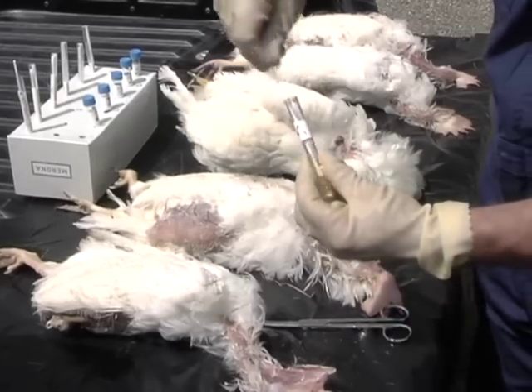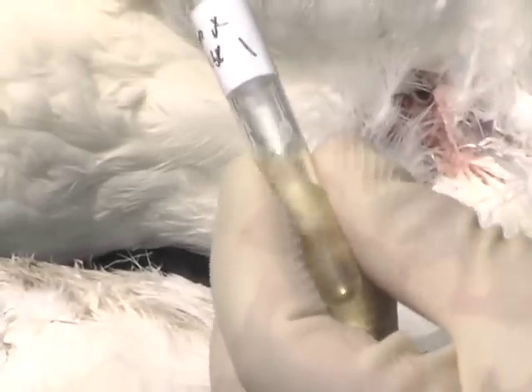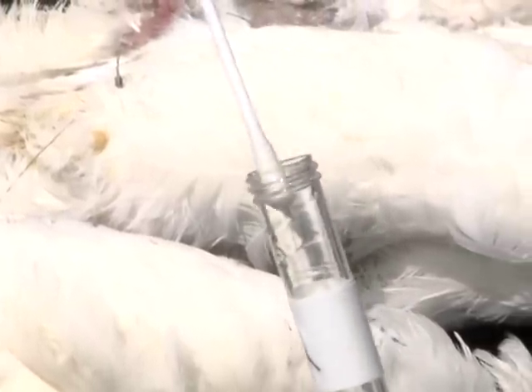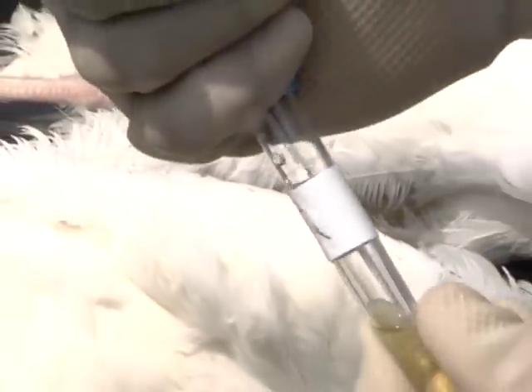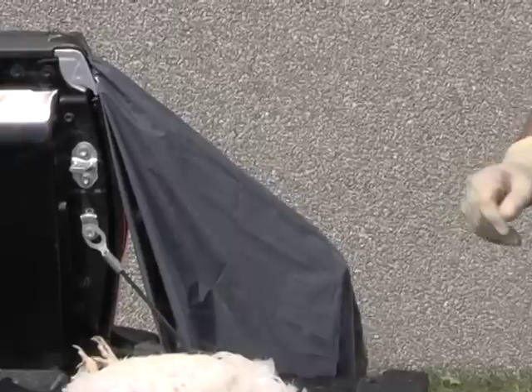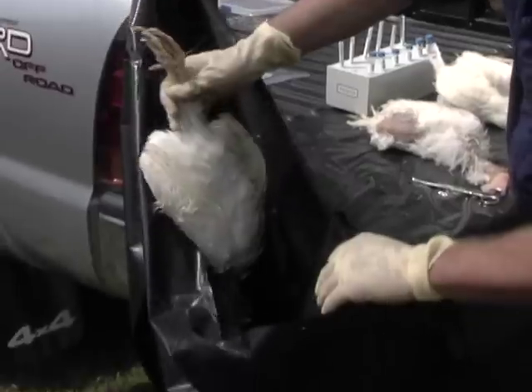Place the swab in the BHI broth and swirl vigorously. As you remove the swab from the tube, squeeze out as much fluid from the swab as possible. Replace the lid on the broth tube. Discard the used swab into the trash bag on the right, and discard the chicken into the trash bag on the left.